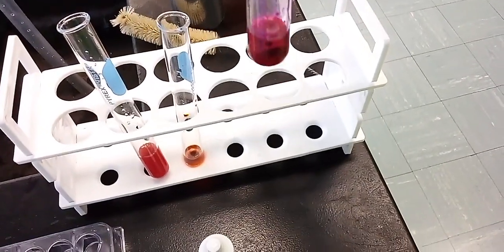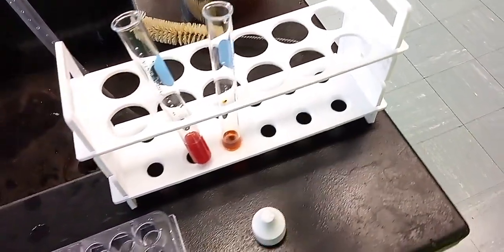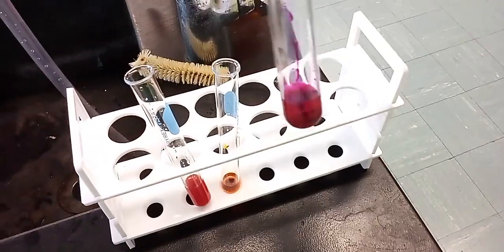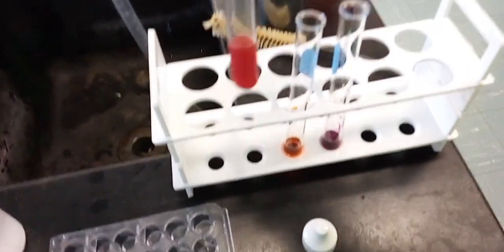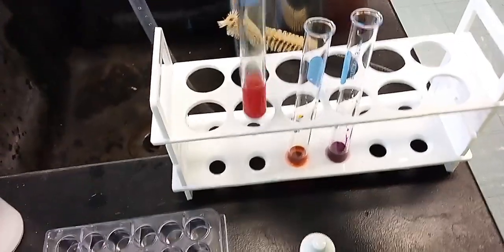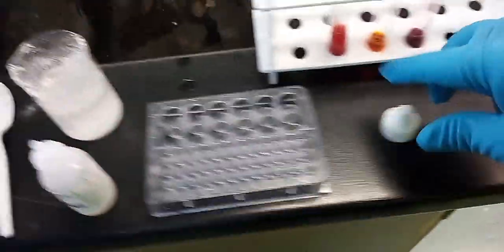This is one of my favorite reactions, or one of my favorite color changes, when you change the color of phenolphthalein from clear to pink. It's a beautiful reaction. I like this one too. I've never seen this one before. This is the first time using methyl orange here, and I'm fascinated by it. So yeah. Any questions? Please let me know.